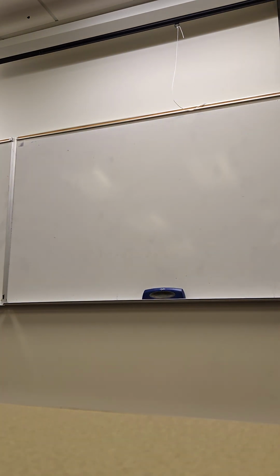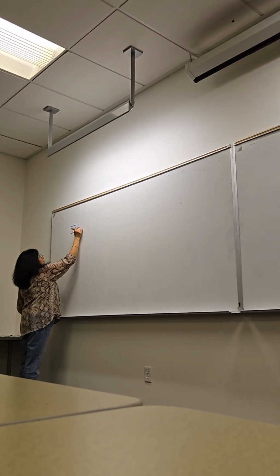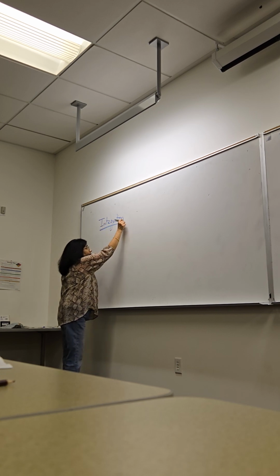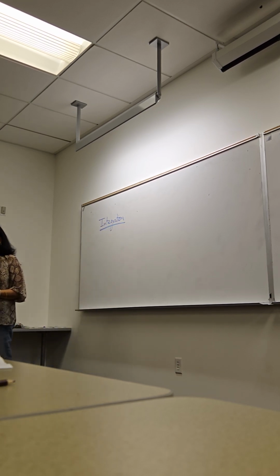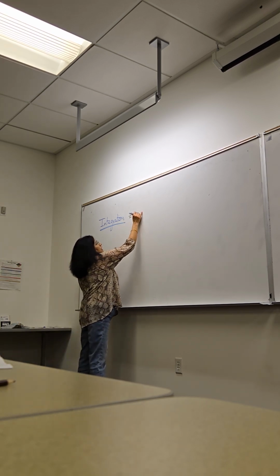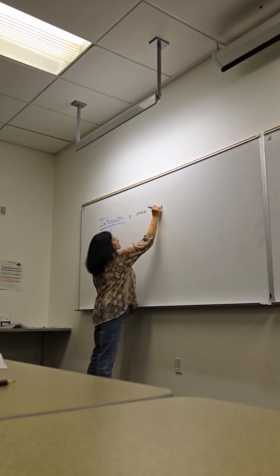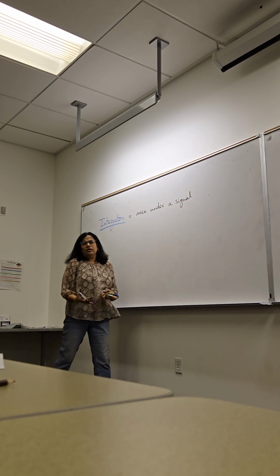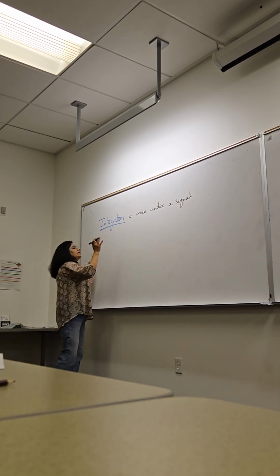Questions, guys? Okay, then let's go to the second point. Can somebody remind me what's the second feature of an NMR spectrum? Integration. Okay. Integration is defined as, what integration really means, it's the area under each signal. Now, that's really what it means. So basically, please just try and understand this.